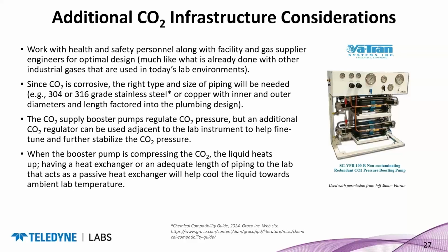Because CO2 is corrosive, like talked about earlier, the right type of piping is needed. 304 or 316 grade stainless steel is preferred. One can use copper, but especially for the larger systems, you'll want to use stainless steel piping. That does add some cost to your facility's build, but once it's there, you're good for many years.